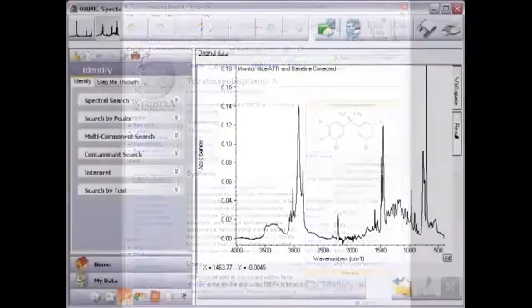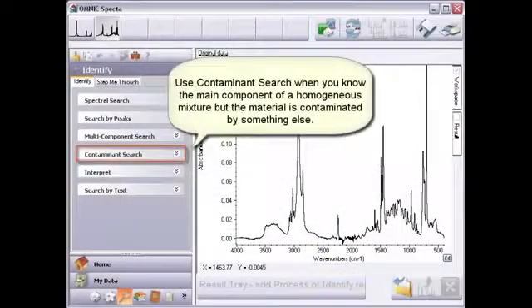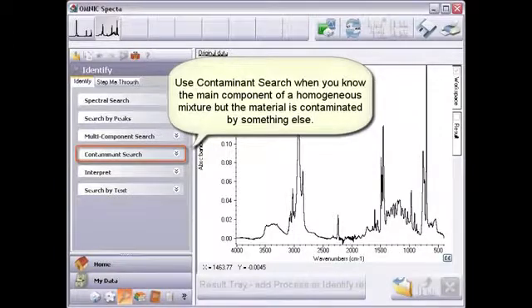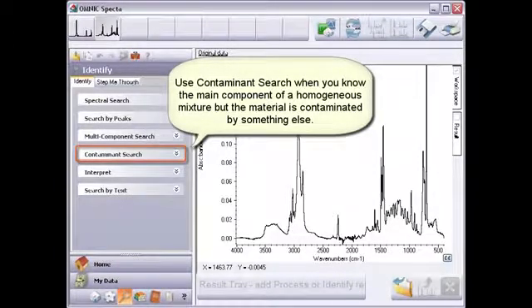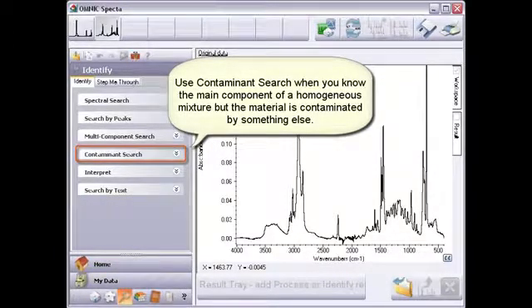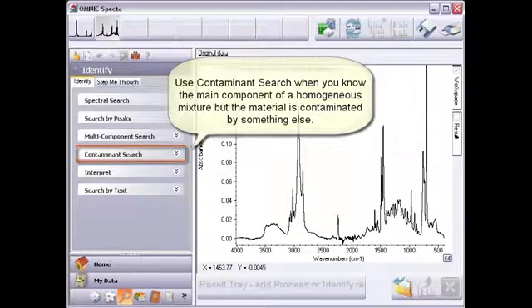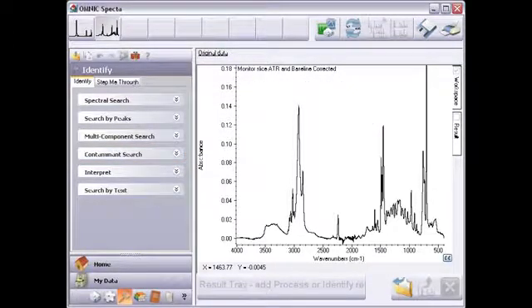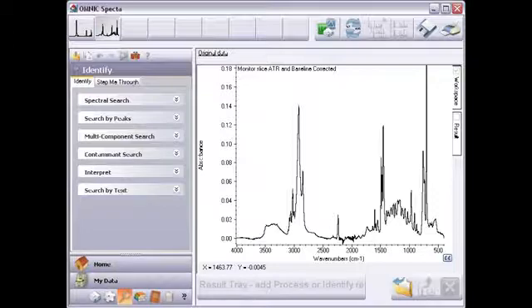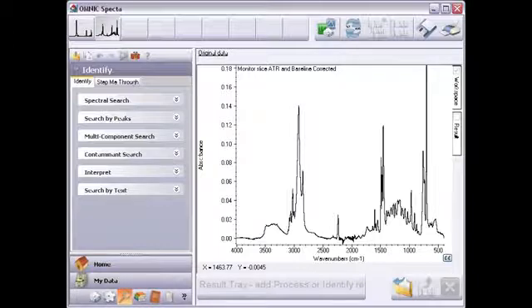Use contaminant search when you know the main component of a homogeneous mixture, perhaps from your production line or supplier, but the material is contaminated by something else or by multiple things. The contamination could be from an environmental source or from an additive such as a plasticizer or flame retardant. Contaminant search first removes the spectral information from the known component, so it can focus on the unexpected constituents.